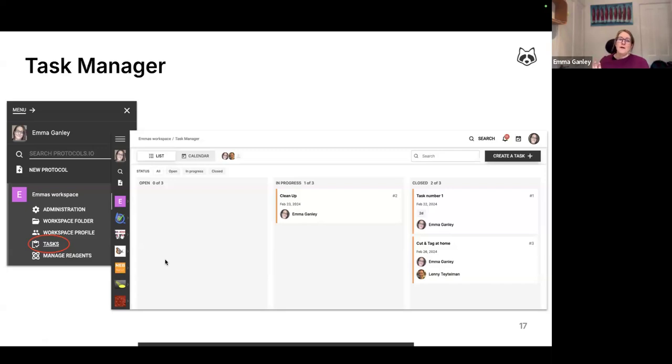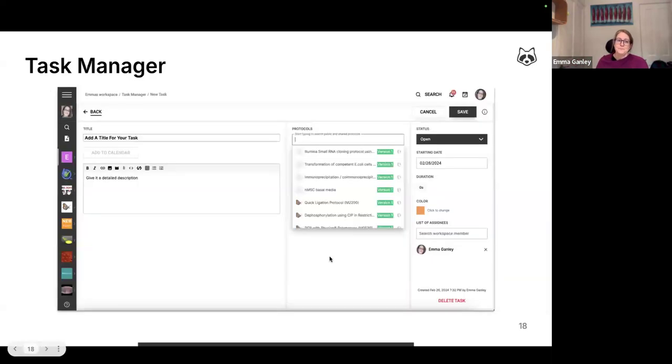So you could plan out your entire week of, I'm doing protocol A on Monday and Tuesday, and then it will be a different protocol on Wednesday. I know exactly what the sequence is of things that I'm going to be working on through the week. I can actually schedule them out, make sure I've got the right amount of time for each one to work over the next week or two.